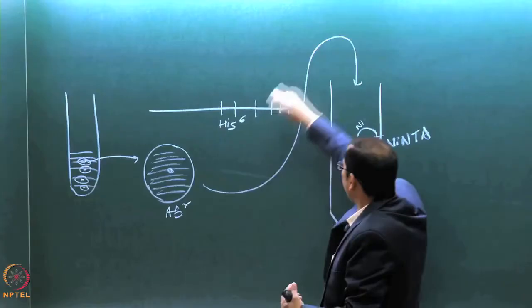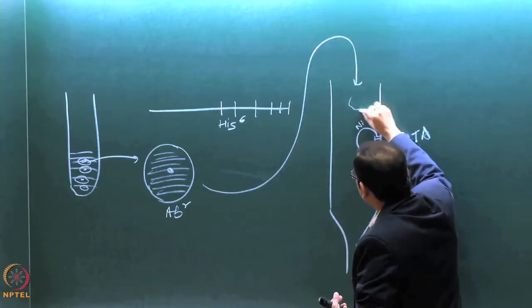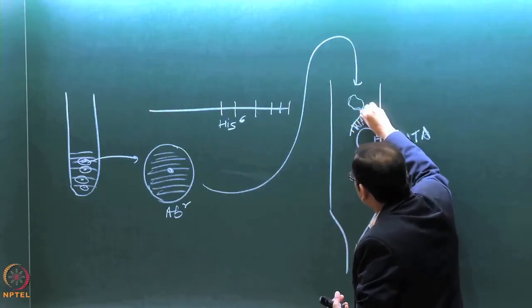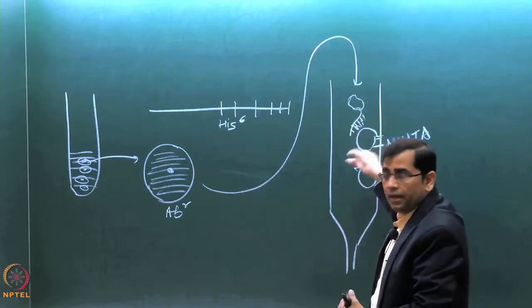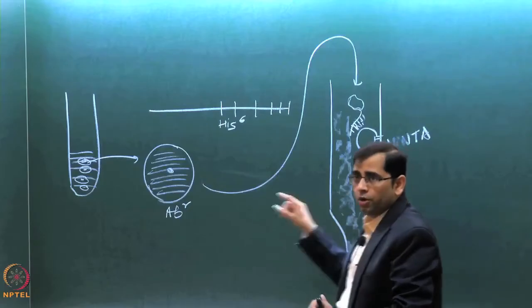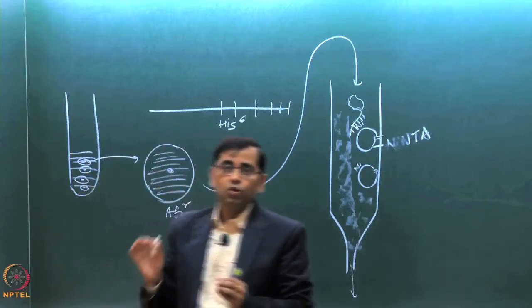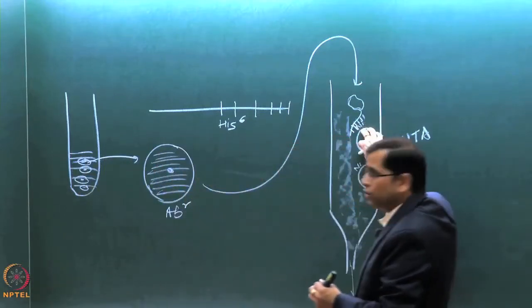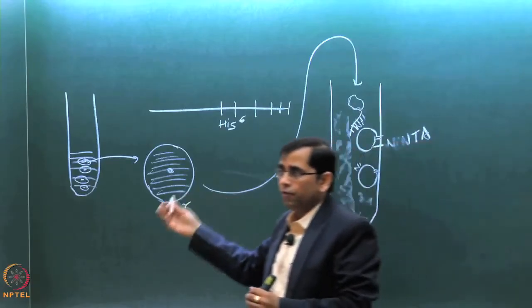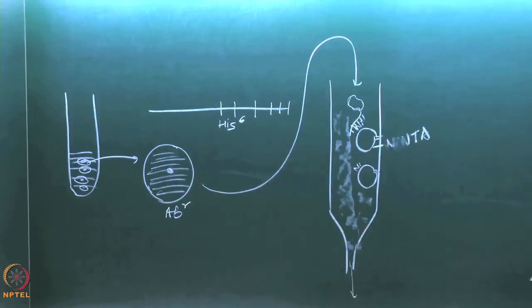So now all the proteins which are coming here, let's say this is the protein which has this 6 histidine sequence, is going to come and bind to the nickel beads. Everything else is just going to pass through into the flow through. So all the non-specific things can be washed off, and then those which are specific, your protein of interest, you can enrich using affinity chromatography, and then purify those proteins further for your analysis. This is one of the ways of doing protein production.